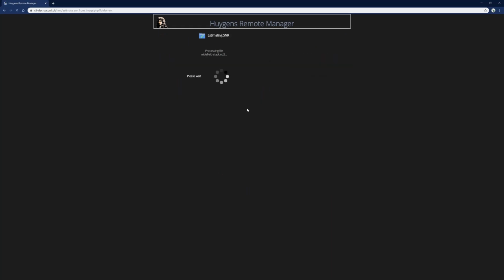And now the program will give us an estimation of the noise levels by building different simulations, and it's up to us to decide if those signal to noise ratios are correct or not. So here it takes quite a bit of time, I think, because the data set is quite large. Hopefully it's not stuck.